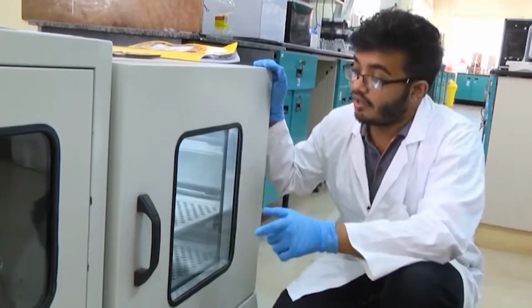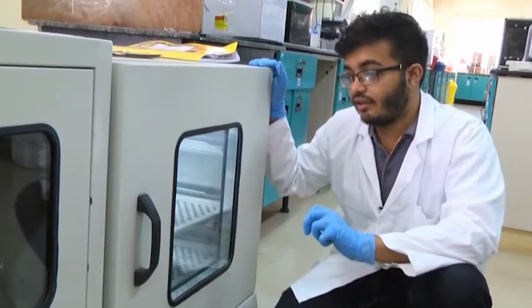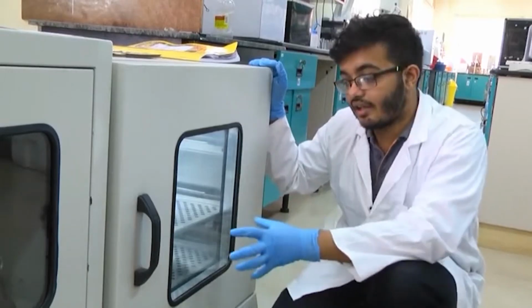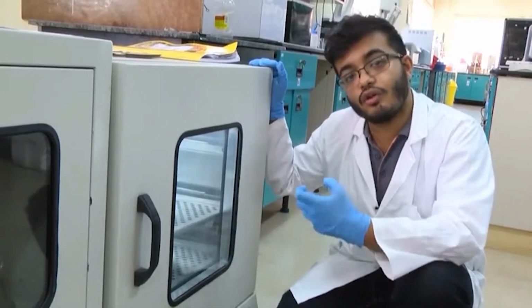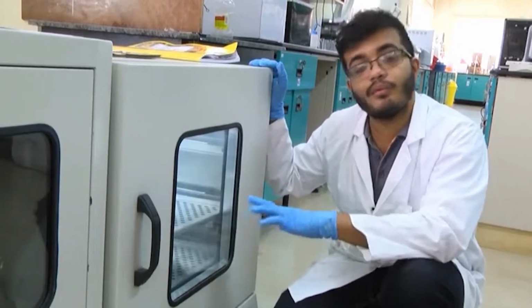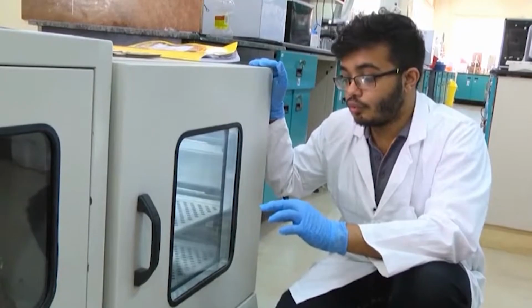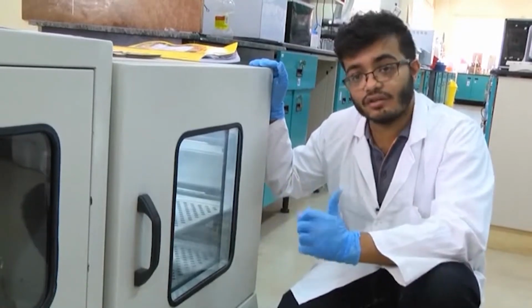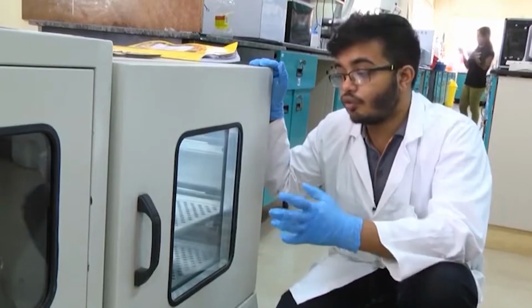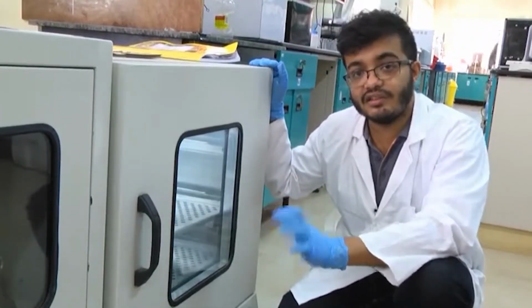However, if we get colonies, that means that the bacteria which survived on this antibiotic plate have successfully taken up our ligation product, which contains an antibiotic resistance gene in the plasmid, which enables them to survive here. And once we get colonies, we are going to make cell stocks, isolate plasmid from them and send them for sequencing to finally establish whether we have our gene of interest in them or not.